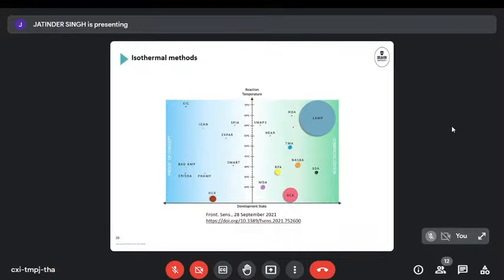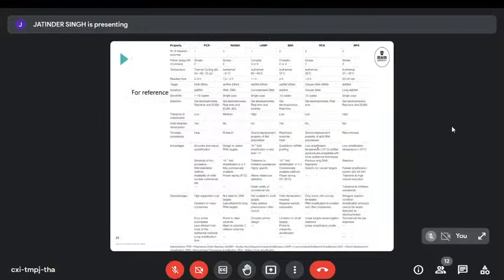For the chip work, it's probably most relevant to look at what's going on with the more commercially available ones, where we've got rolling circle amplification, RPA, NASBA, and LAMP as the big ones, and they have all been translated to the microfluidic format. All these amplification techniques have their own pros and cons. And while reading it now here in the lecture is not possible, I think it's good for reference, if you have an interest in DNA amplification, to have a look at this table, because it provides the pros and cons very clearly of the different amplification techniques.